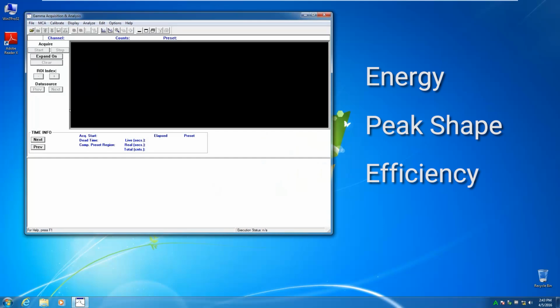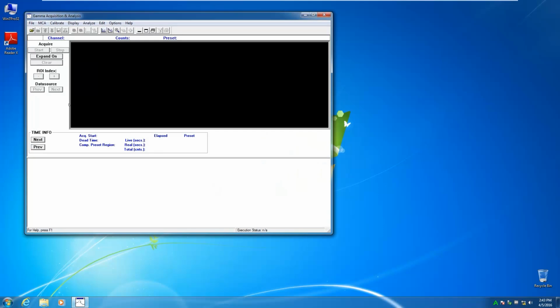Following a formal calibration of the system, it is reasonable to expect some drifting or fluctuation in observed spectral peak channel locations. These unwanted changes in peak centroid channel are usually small in magnitude and easily correctable by performing simple adjustments of the fine gain setting for the affected detector data source.